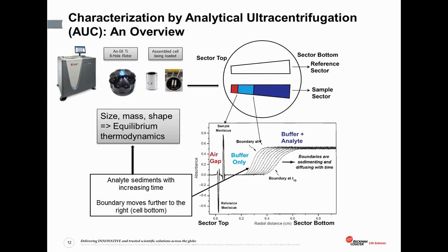Now, analytical ultracentrifugation is a solution phase, native state hydrodynamic technique, which looks at the sedimentation of analyzed particles under a very high centrifugal force field and tracks the movement of these particles as they move down the sample sector in an AUC cell and interprets that movement in order to get the size, the mass, and the shape of the analyzed particle.